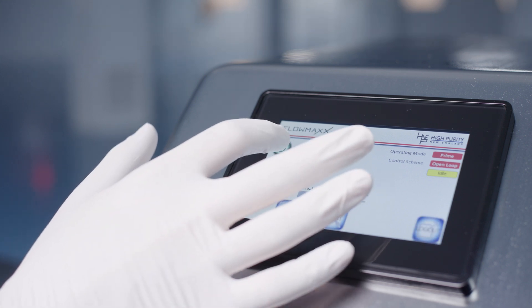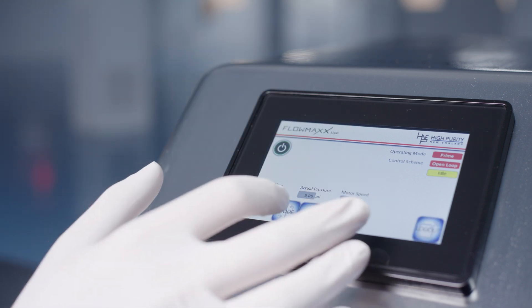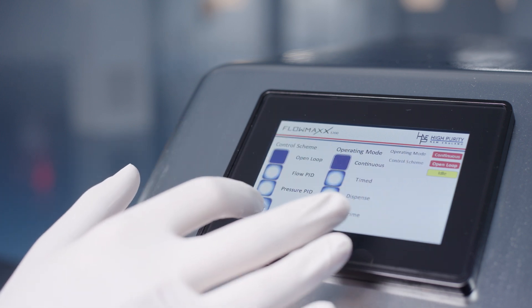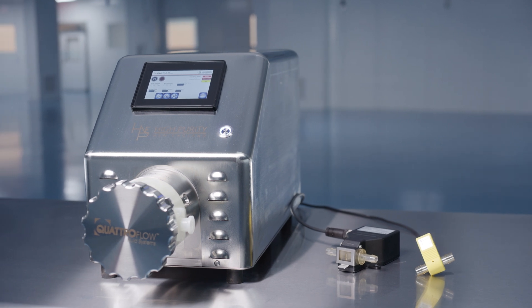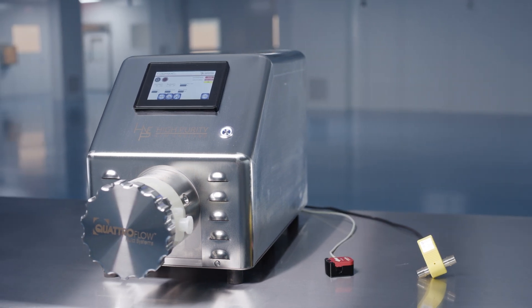Easy to obtain accurate results — calibrate Flomax to your unique bioprocess in just minutes. Easy to integrate sensors, allowing for real-time measurement of both flow and pressure.